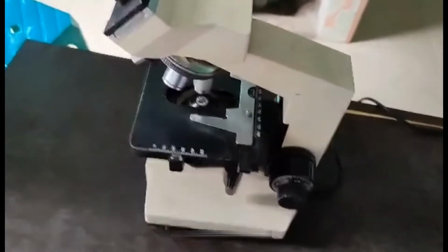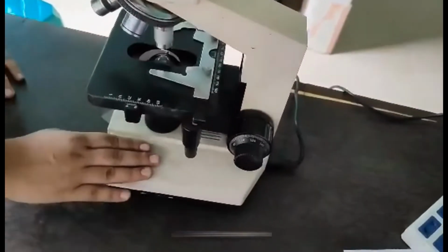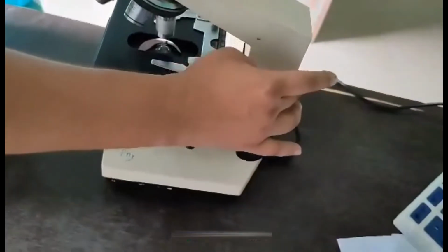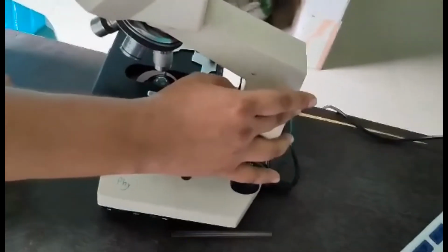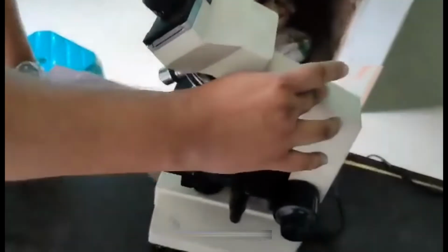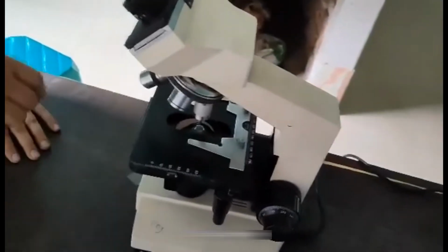Students, now I will tell you what the functions of these parts are. This is the base. The base supports the microscope, and then the pillar. The pillar is used to lift the microscope to your suitable angle, and then the arm supports the focusing and magnifying system.